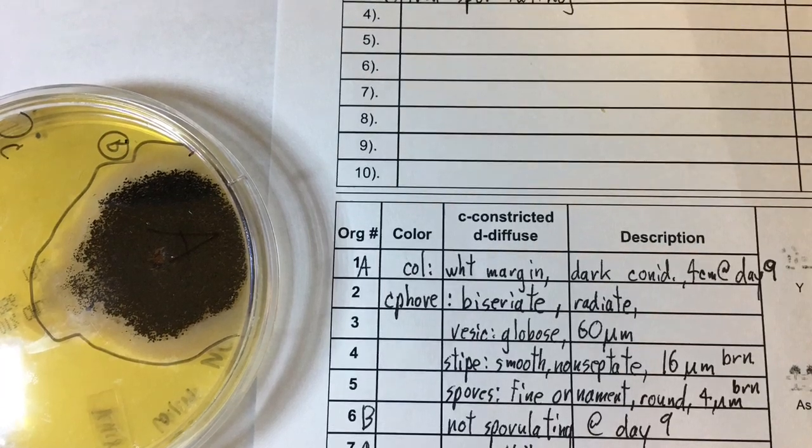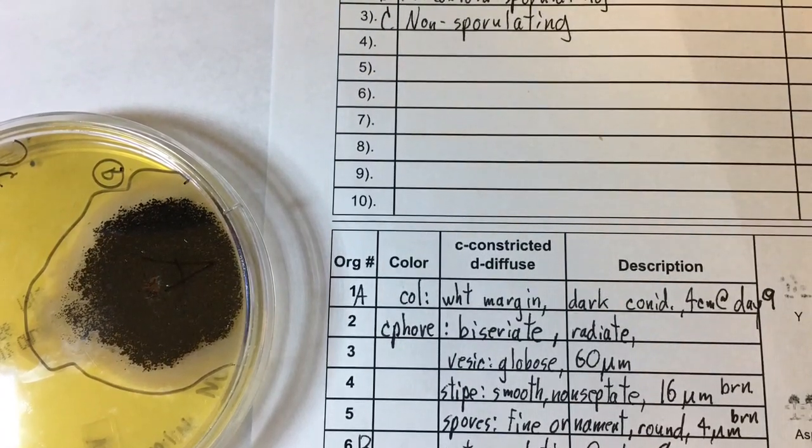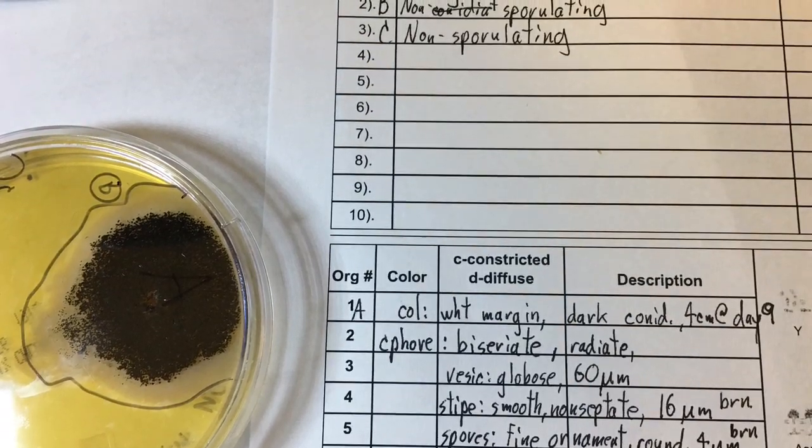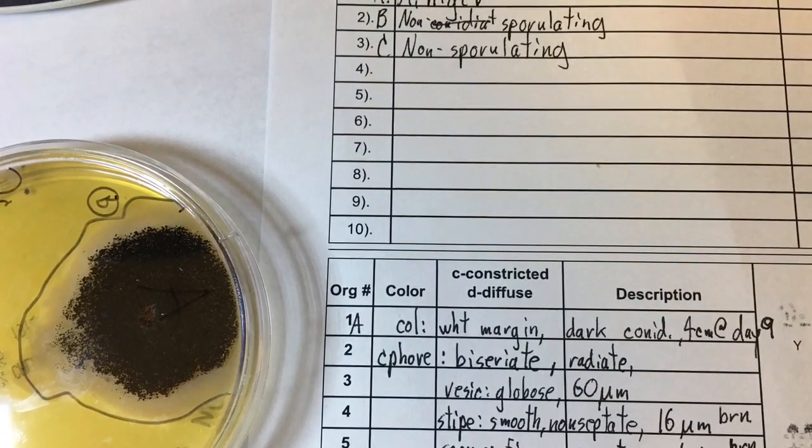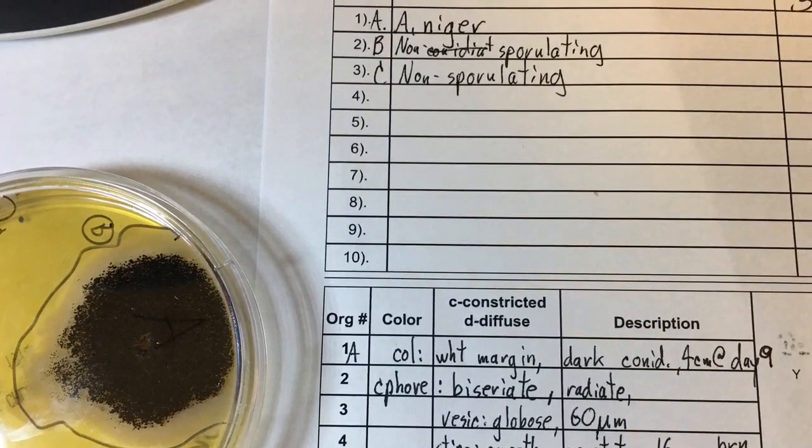All right, well I hope that you have enjoyed this little demo of Aspergillus Niger. Please leave comments, and I will try to do a follow-up with Rhizopus or Mucor when I encounter it. Thanks a lot.